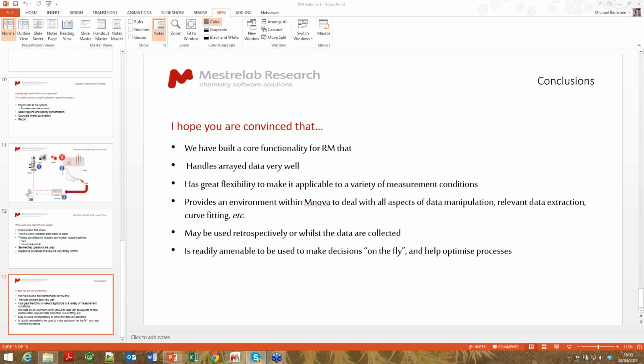If you show something in absolute value mode, then I guess you lose your ability to quantify it. So I don't know whether quantification would work there. Sunil, perhaps you can send me a data set and I can think a little bit more about your question. I haven't come across that yet.